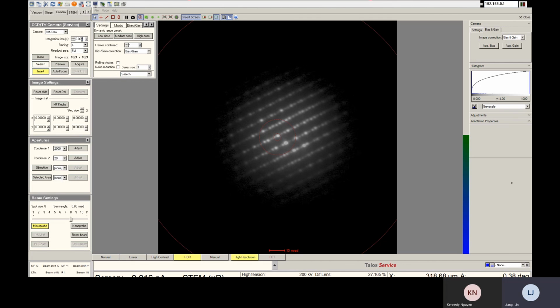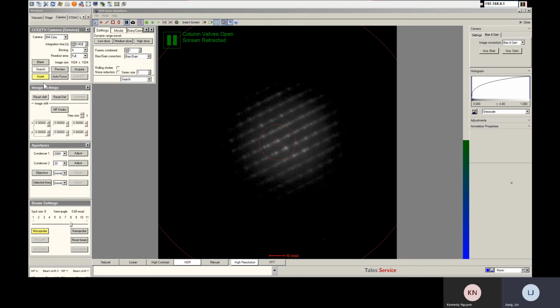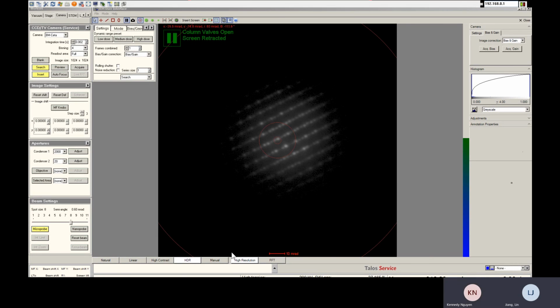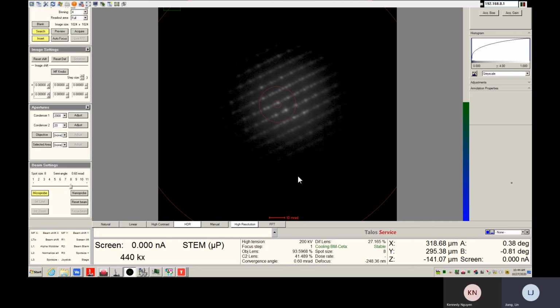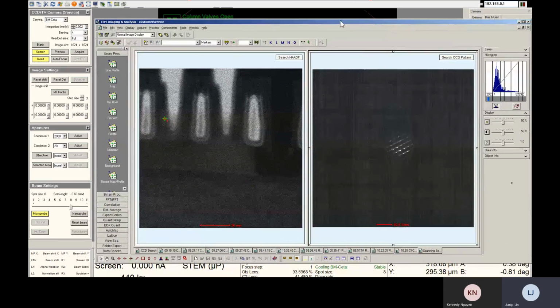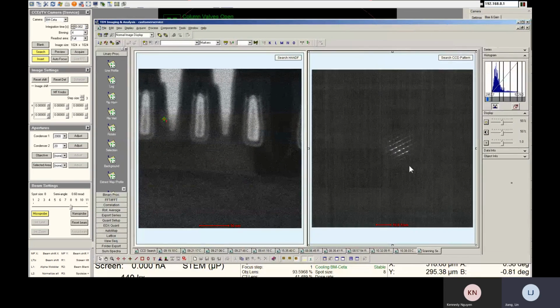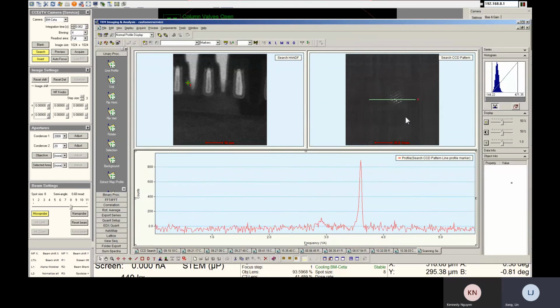For one frame, you probably go for a very small time first, and you lift the screen. You go search, and you take a look at your image. Okay. Put there. You can read the object information there. You can go on fine.